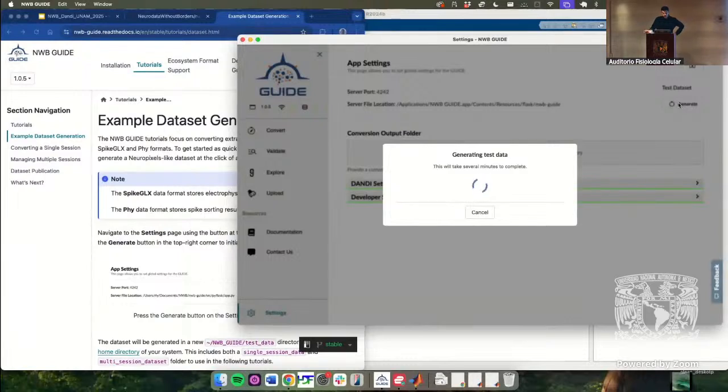These would be the most common formats that we would usually see. We support, again, over 40 different formats. We just wanted to pick one that was fairly common in the field that we've really optimized this for.